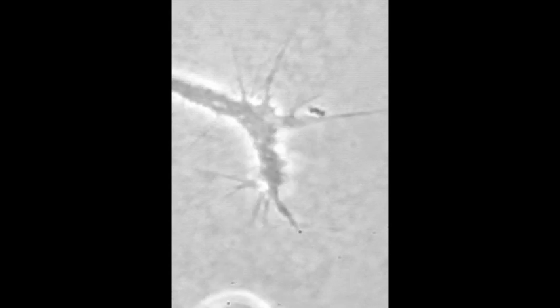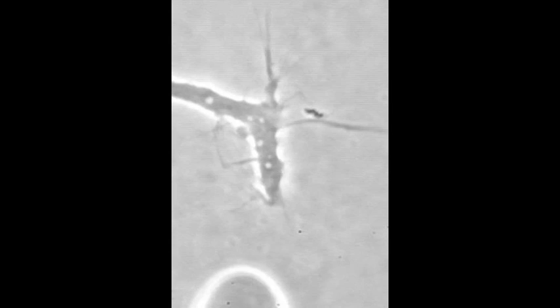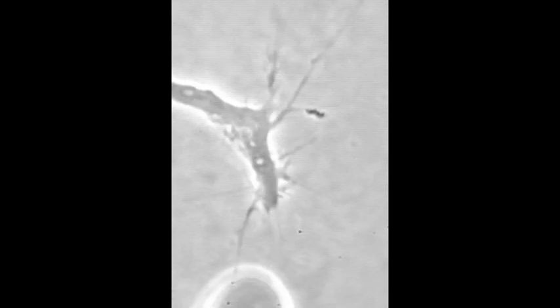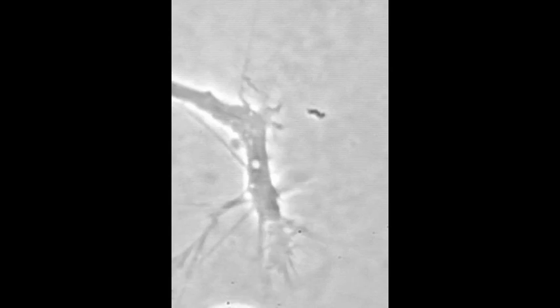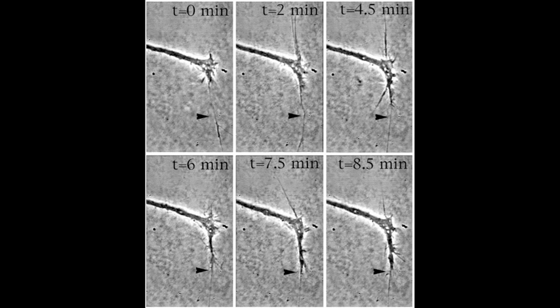Soon, growth cone contents move into a filopodium that adheres along the border, leading a turn to remain on the laminin. This figure shows that growth cone material advances into a single filopodium over the eight-minute duration of the turn.